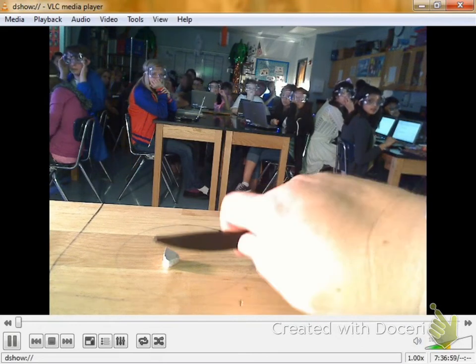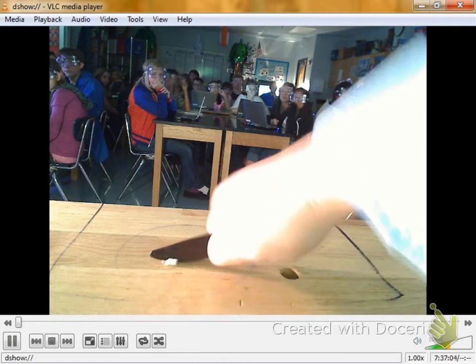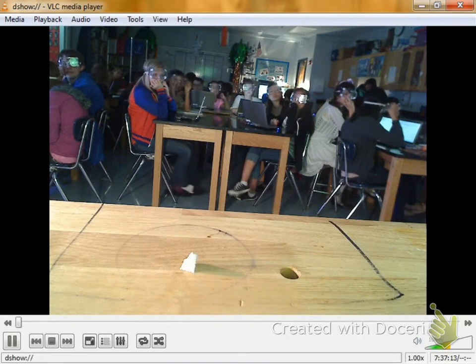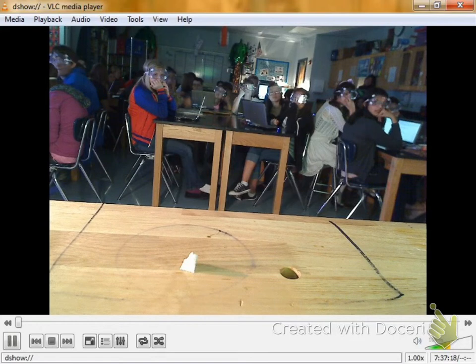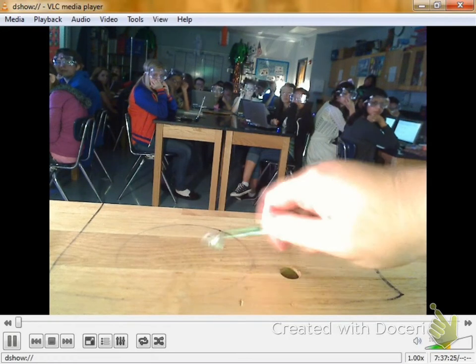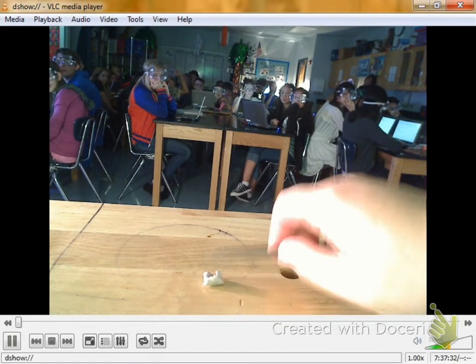Watch how easy it is to cut this one. Ta-da! Metal cut like cheese. Some kids today have asked me, well, it cuts so easy, is it kind of like putty? Well, I can kind of squish it and mash it around. It's a little bit, I got to put a little effort into it.